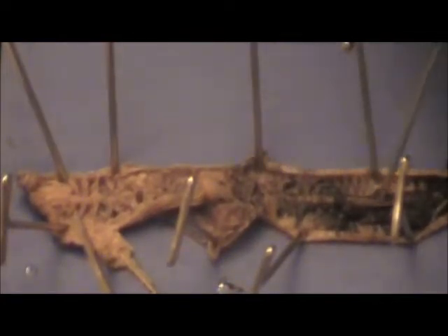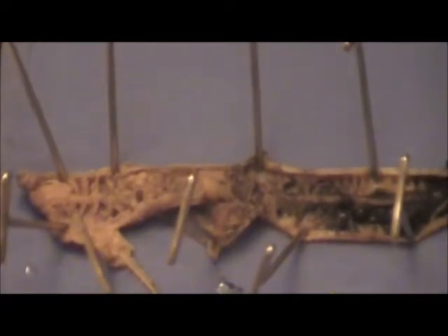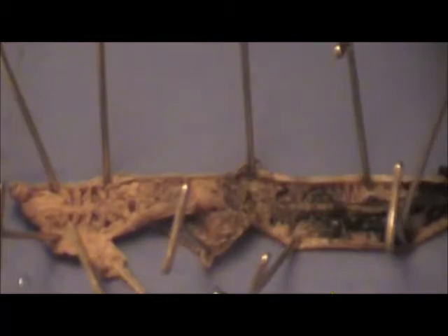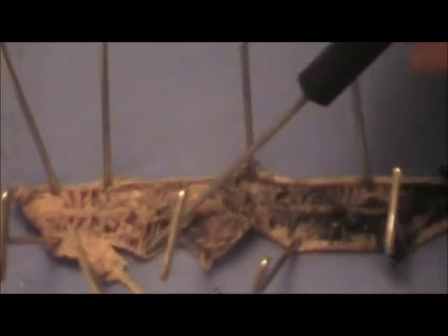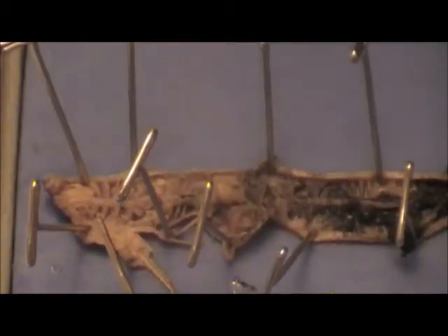And then that goes into the intestine, which is a very long intestine because it needs all that time and surface area to get the nutrients out of the dirt. So you can see I split open the intestine here, and you can just see the dirt. Also, these little bulbs that are kind of hard to see. Let me get another T-pin. Let me pull all these T-pins back.